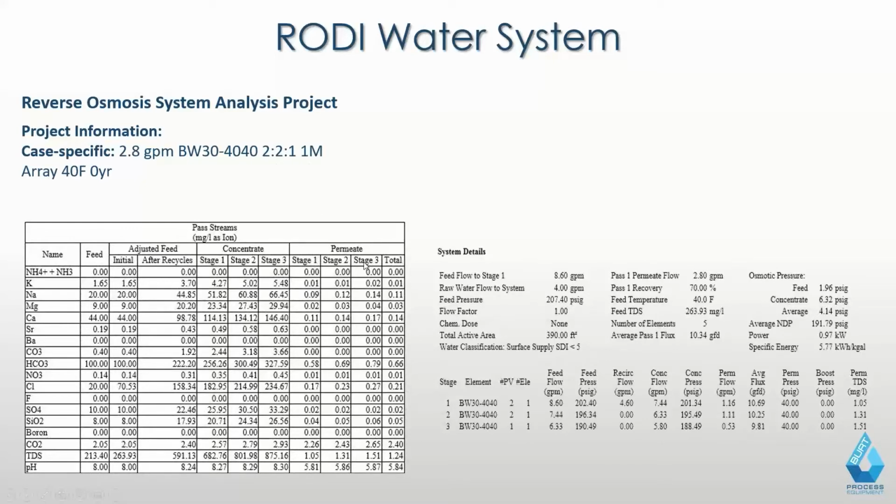That's why you have stage 1, stage 2, stage 3: two membranes that then feed two membranes that then feed one membrane with their reject. When an RO feeds another RO, that's referred to as a two-pass RO system, which is kind of an oversimplification of the term.